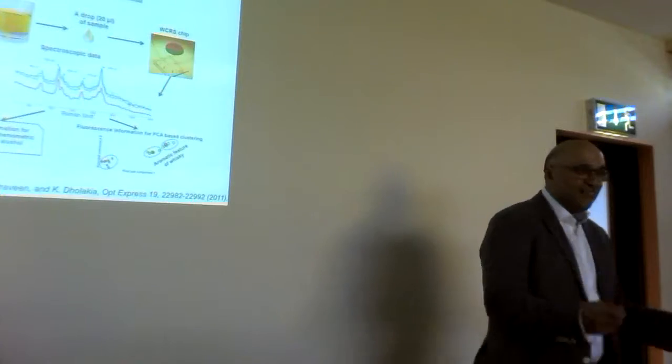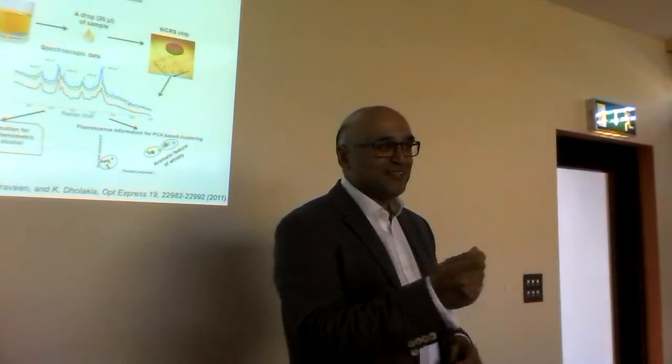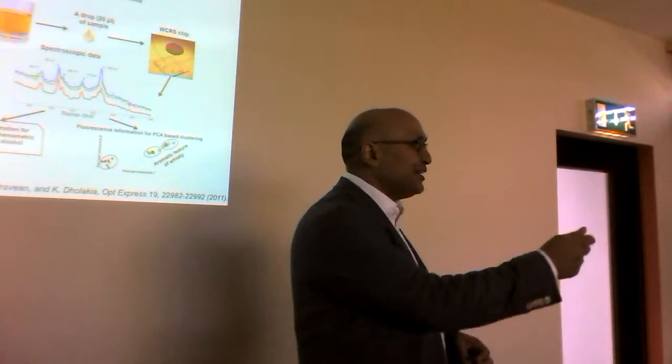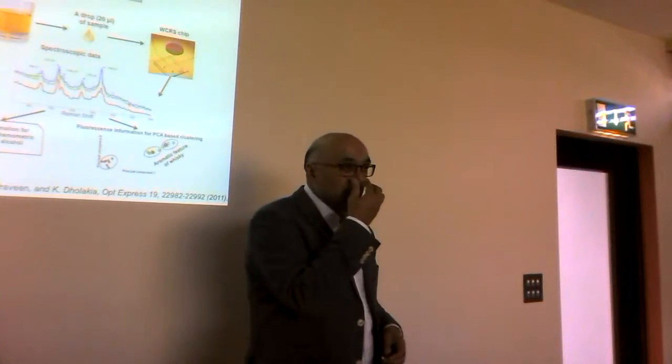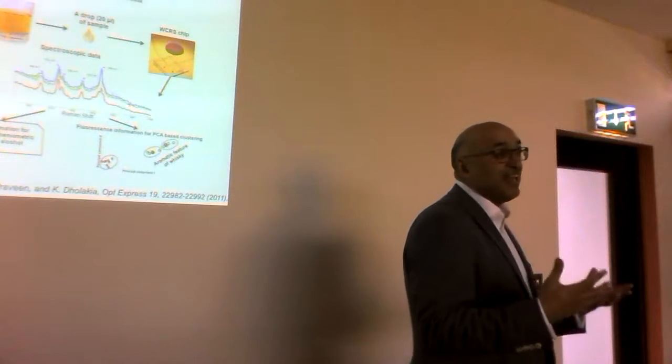In other words, if I take Raman signals and I tell everybody that if I do this, I can tell you that someone's got colon cancer to 90% in St Andrews, it doesn't mean you'll use it here in Galway, or in London, or Singapore, or New York, or wherever. That's because we don't have standardization, we don't have the protocols, and that's very hard to do.